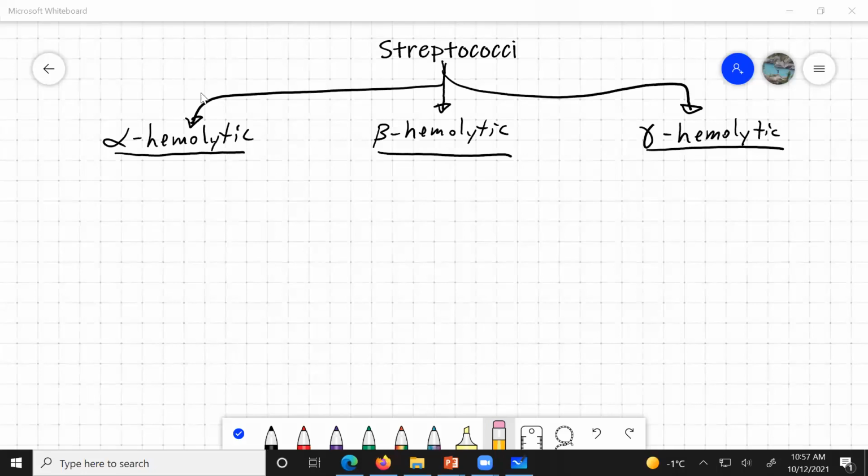You can see I have streptococci thrown on some blood agar, and we have 3 options. We have alpha hemolytic, beta hemolytic, and gamma hemolytic. Okay? So where's this pen? So I'm going to start off with the beta hemolytic because it is the most complete hemolysis. So here's my note here. See if I can write on the screen. Uh-oh. Try again. Okay, there we go. So beta hemolytic is clear, right? And so this would be what we call complete hemolysis.